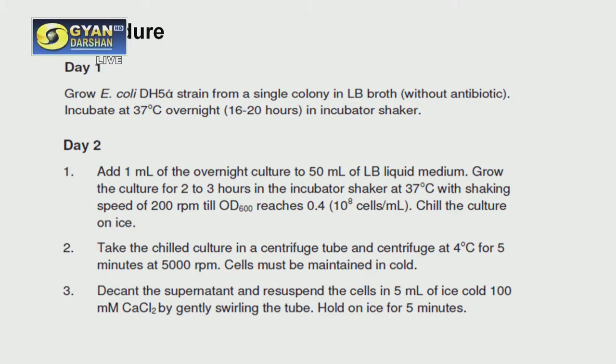The medium which is normally used is the Luria-Bertani medium. And this Luria-Bertani medium consists of peptone, yeast extract, and sodium chloride. So that is actually the composition of the Luria-Bertani broth or growth medium. So you have to grow the bacterial cells in Luria-Bertani medium, and you get an overnight culture.